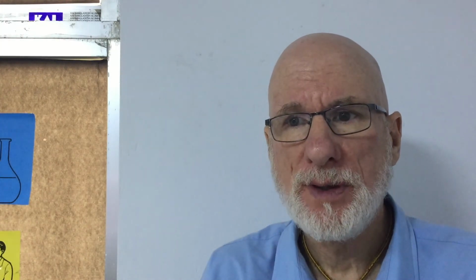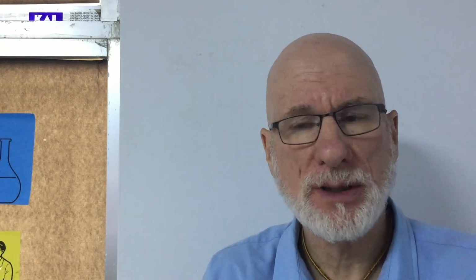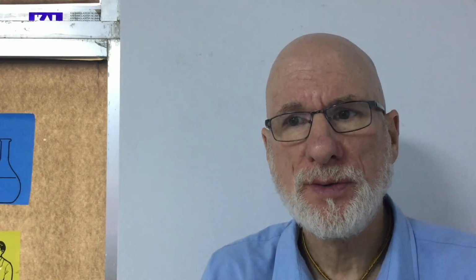You should know these symbols, but the best thing to do is to listen to the pre-lab instructions of the teacher relative to what safety protocols to take during the experiment.